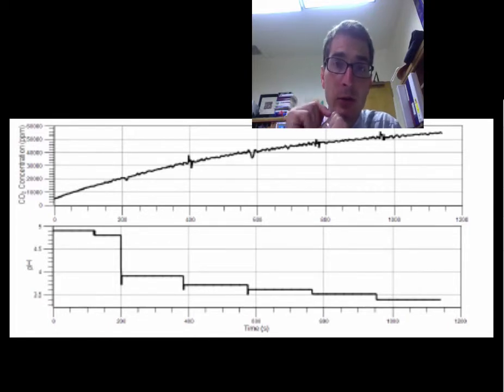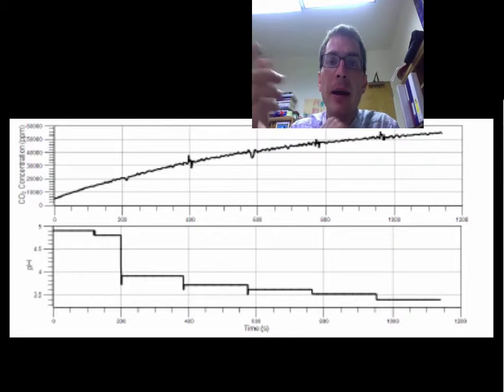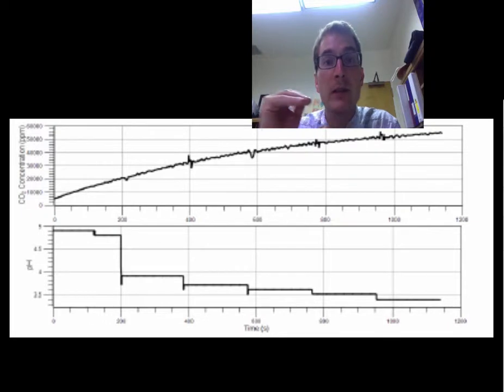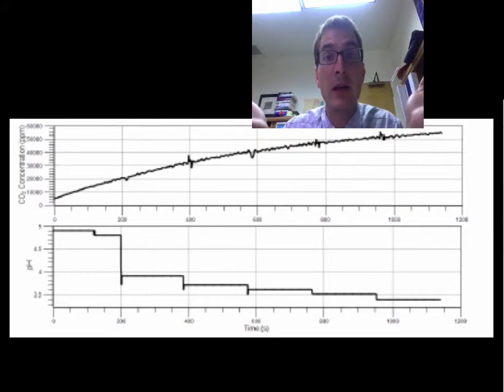So what I encourage you to do is try to figure out how you develop an ED50 from your data first. So pause now if you haven't tried that at least, and then use this to supplement after giving it a good amount of thought and effort. Because I think each of you could figure it out. There are some conceptual realizations you have to make and how to manipulate the data so it's useful to create an ED50, as I'll discuss now.